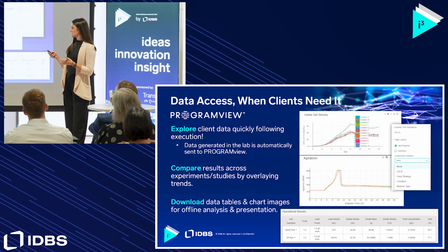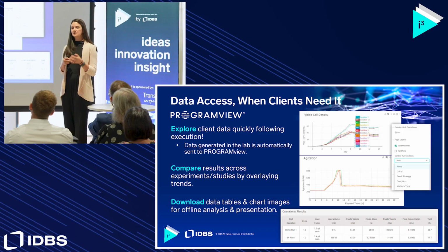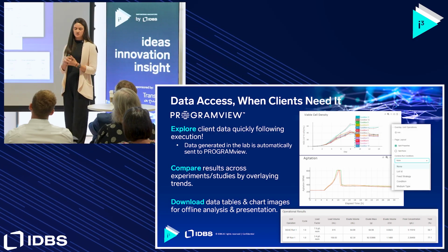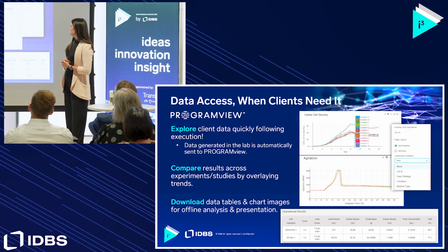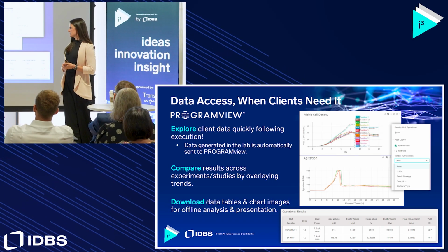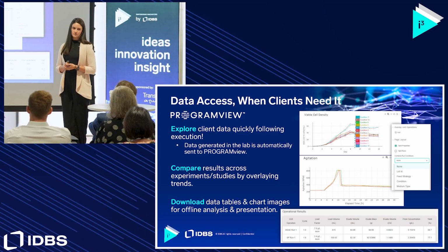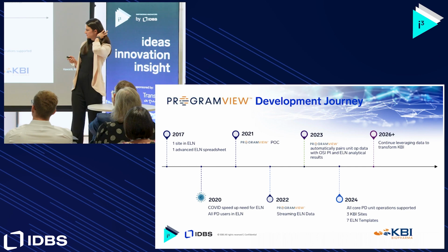Once the experiments are done, we can also compare the results across multiple studies or programs and overlay trends and build your own customization for how you want to view your data. And then if additional analysis is required, you can download any of the data directly from PROGRAMview for your own offline analysis. So how did we actually build this?